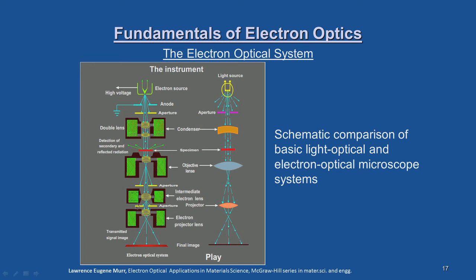We will look at the details when we deal with this, especially the transmission electron microscope. For the introduction, I just want you to have a feel of these two systems in comparison, so that you do not feel anything confusing. They are all the same, whatever we have just looked at in the light optical system as far as the instrument details or the ray diagram is concerned.